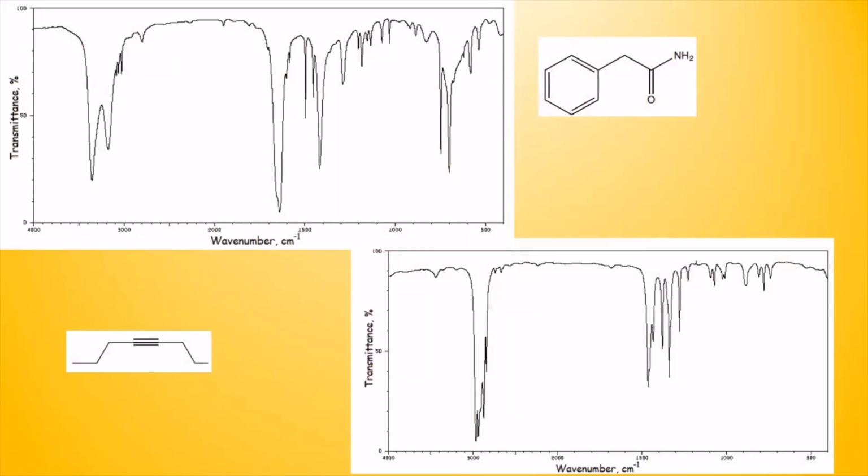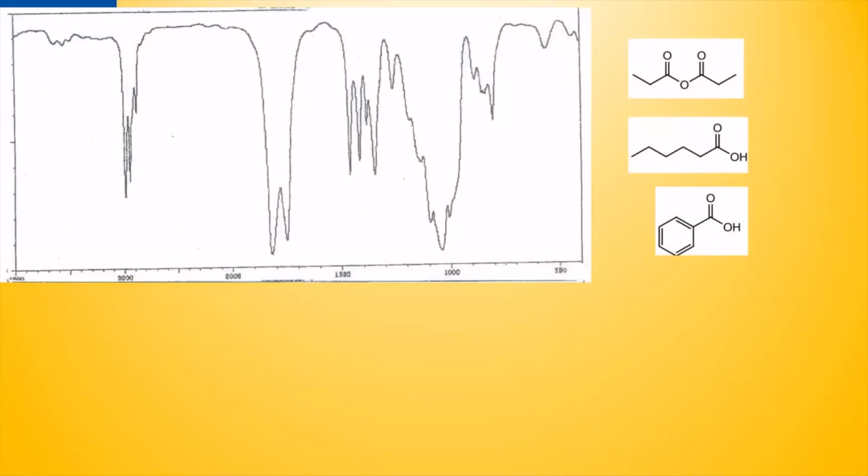So again, this is what we had done earlier. Okay, so here's the molecule. I purposefully threw in 2 extra ones just for fun, and I want you to tell me what this would be. Now, you see this little tooth-like looking thing, right? It's not very strong, but you can still see the tooth, right?